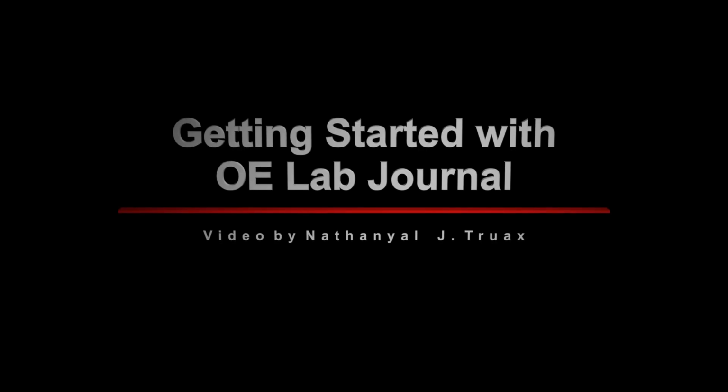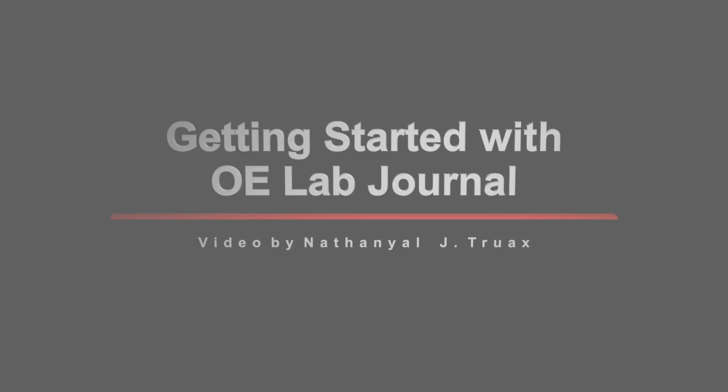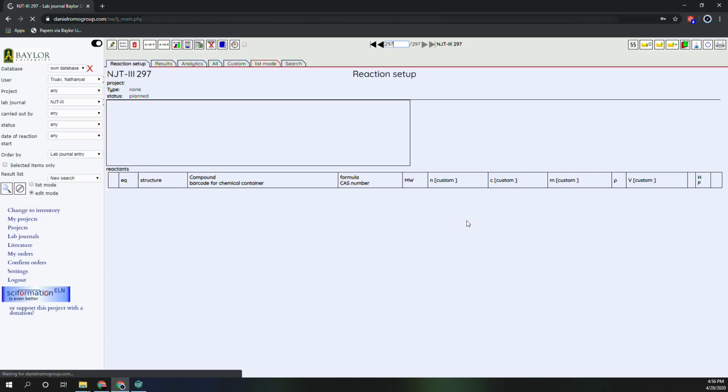This is just a short clip to teach you the basics of how to get started with Open Inventory Lab Journal. First, we'll go ahead and log in. Just instead of clicking Inventory, we'll click Lab Journal. This will open up the Lab Journal page.